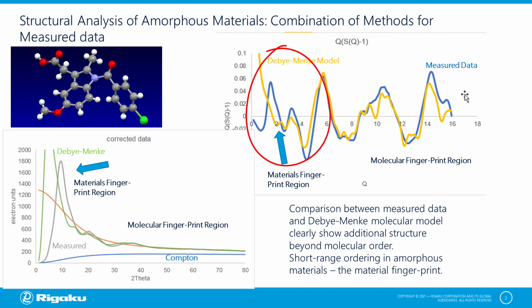Nothing about packing or solid state, nothing at all. This is just like a dispersed molecule in nothing. So this difference here, we call this the materials fingerprint region. And this depends intimately on how the molecule is packing within the solid or the liquid state.